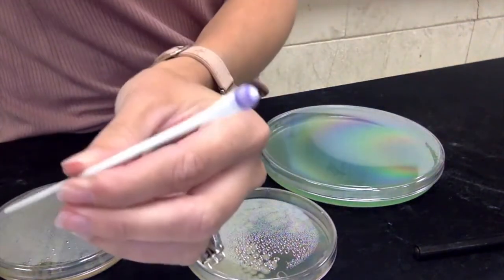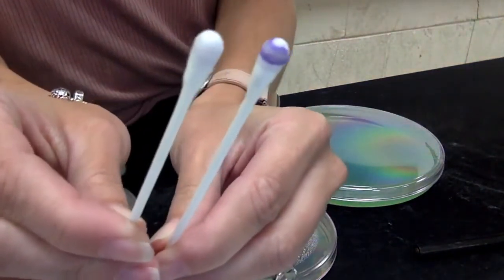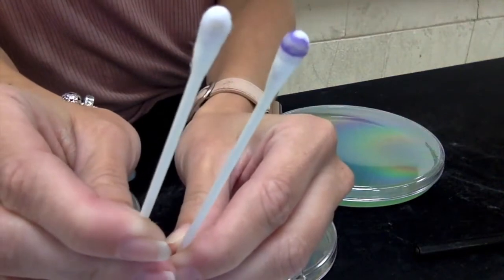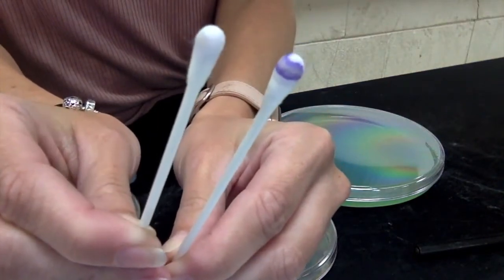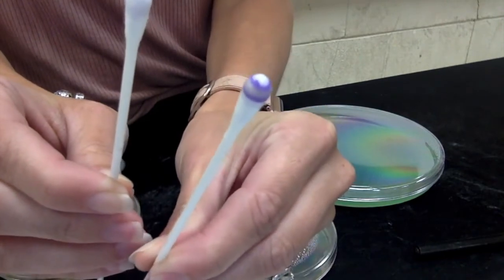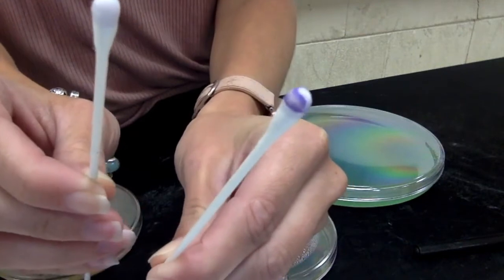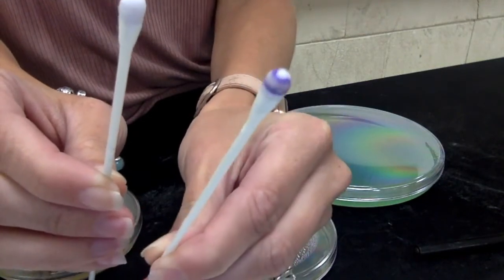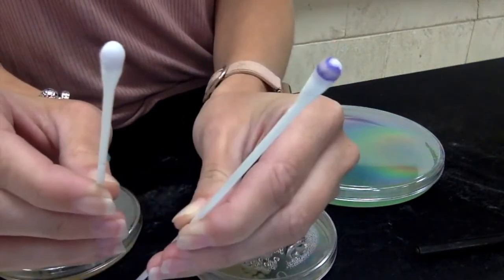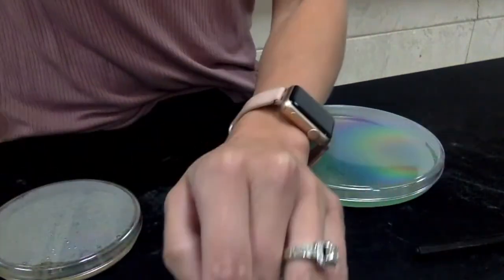So just to compare, here's my E. coli. Clearly the colony is still yellow, no purple color. And here's my positive result. Nice, dark, deep purple colonies. Okay, and that's what we want to see for our positive result for our oxidase. So oxidase positive is purple, negative is no color change on the colonies.